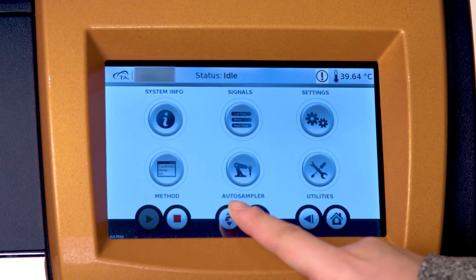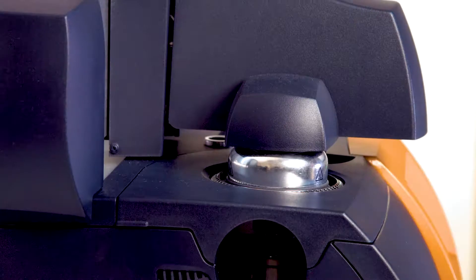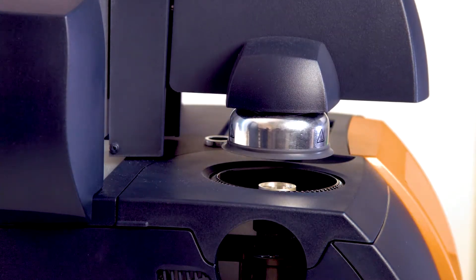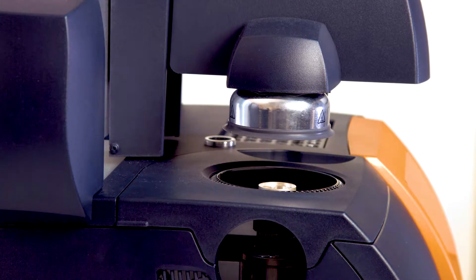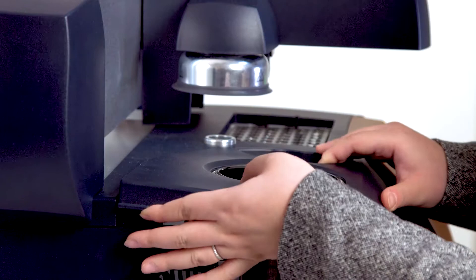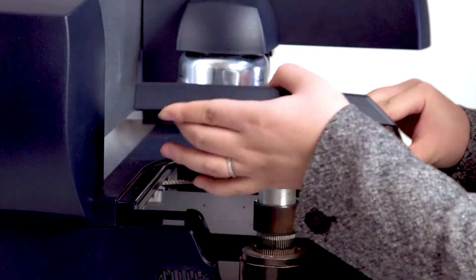Press the lid open and close button on the touch screen to open the lid. To remove the top cover of the DSC, simply lift it up and pull.